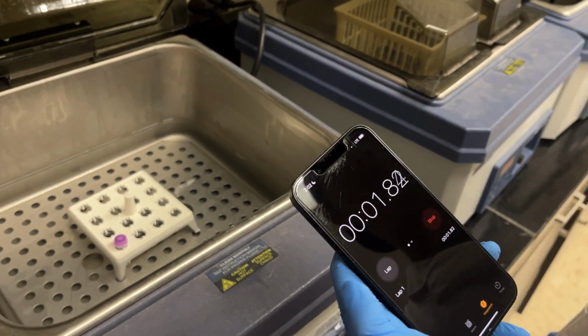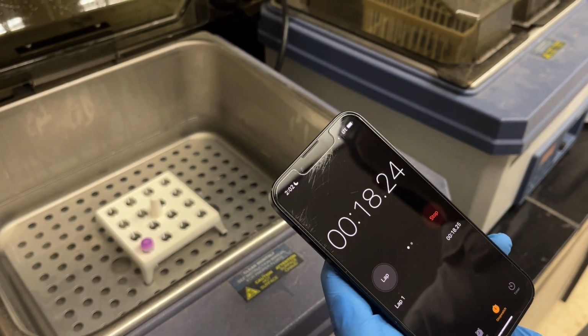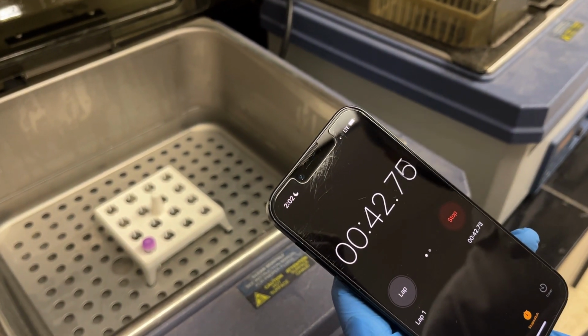So your heat shock can go anywhere from 30 seconds to, I've seen as high as, 2 minutes. Generally 45 seconds works for most of the applications that we use in our lab. So 45 seconds is the one that Jaden is using here.